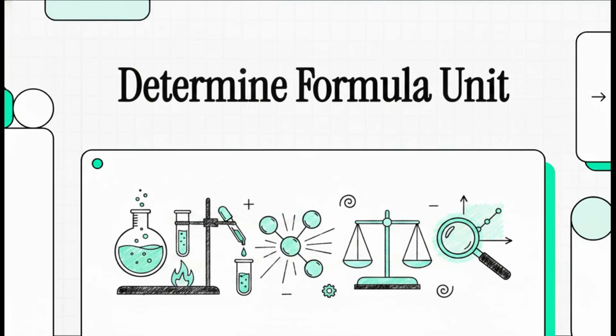Welcome to The Explainer. Today, we're diving into a real chemical detective story. We're going to synthesize zinc chloride and figure out its hidden mathematical fingerprint. It's a classic lab experiment, taking raw, highly reactive materials and distilling them down to a single elegant chemical formula. It's this fascinating journey from the physical world of bubbling acids straight into the abstract world of chemical math, all through the lens of quantitative analysis.